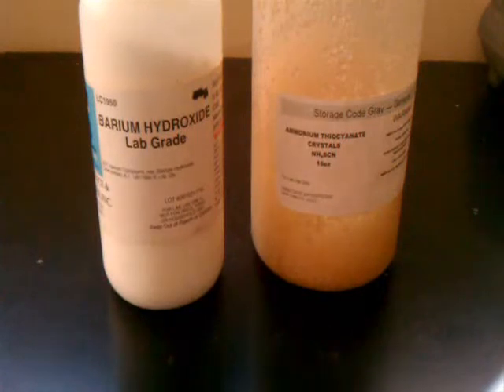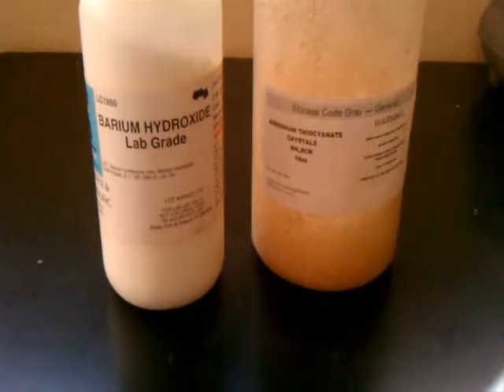Now, normally when barium hydroxide and ammonium thiocyanate react, they give off ammonia gas and form barium thiocyanate and water. This is an endothermic reaction because you start with two reactants and you end up forming three products.